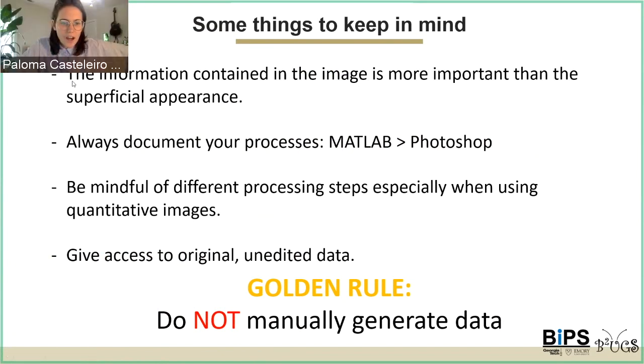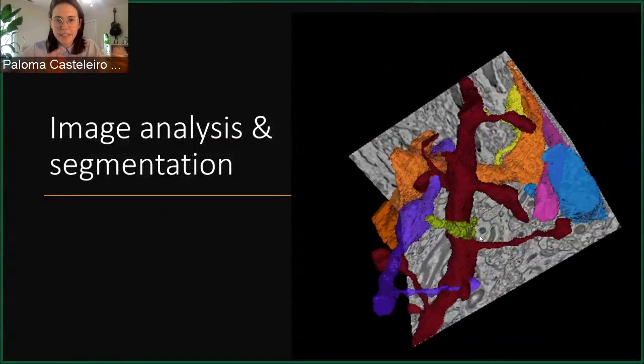All right. Well, yeah, you can go ahead and move to the next slide. So now that we've covered how to get a good image and how to enhance our images in the best way possible, we are going to talk a little bit about image analysis and segmentation with the purpose of knowing how to interpret the images. I think that's kind of the goal that we have for this section. So let's just jump right in and begin with the basics, which is, what is segmentation?